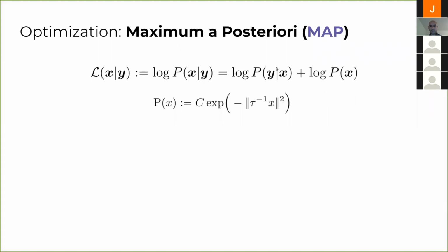This term here, the log likelihood function, is very simple in the sense that it's pretty much given if you make certain assumptions. Usually people use a Gaussian model, where, in the figure that I showed you, when you do projection matching, you compare the projections of your model with the projection images from your raw data, and that becomes this term.